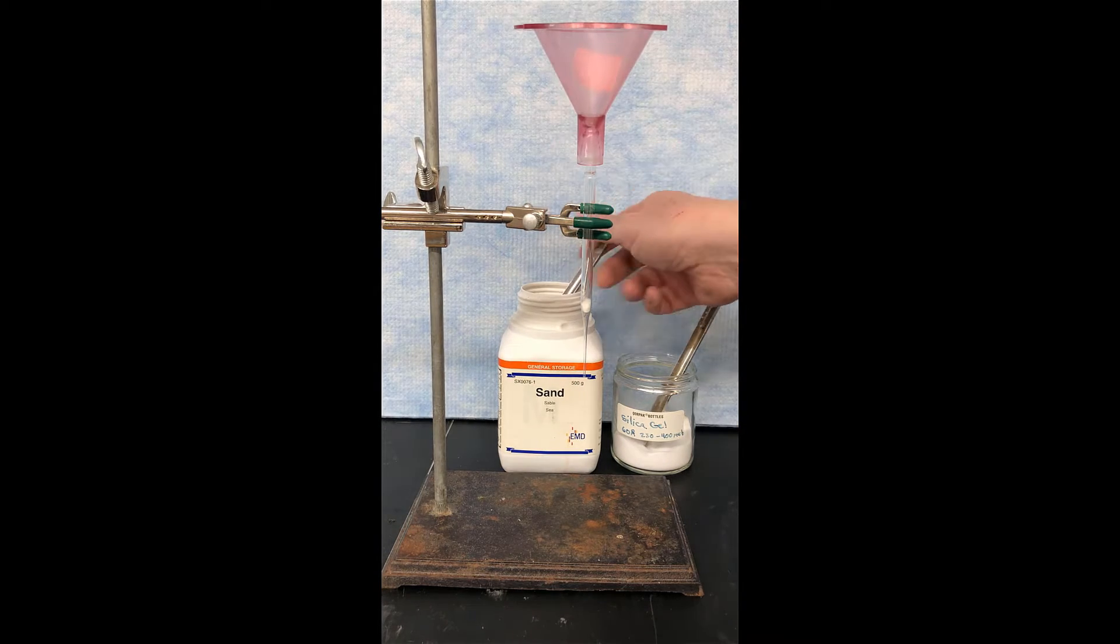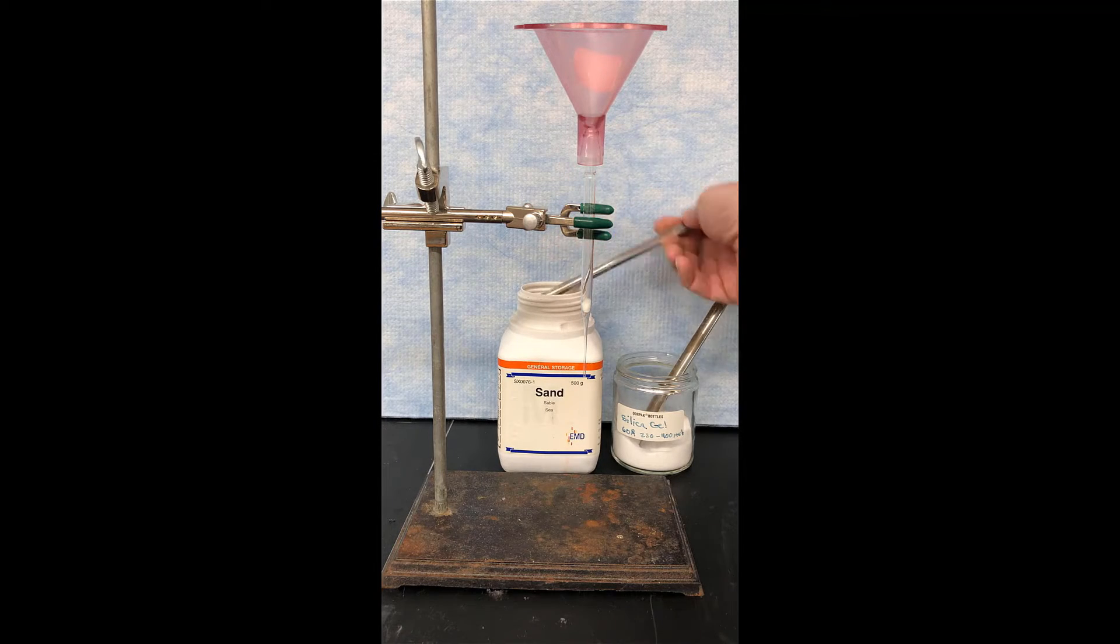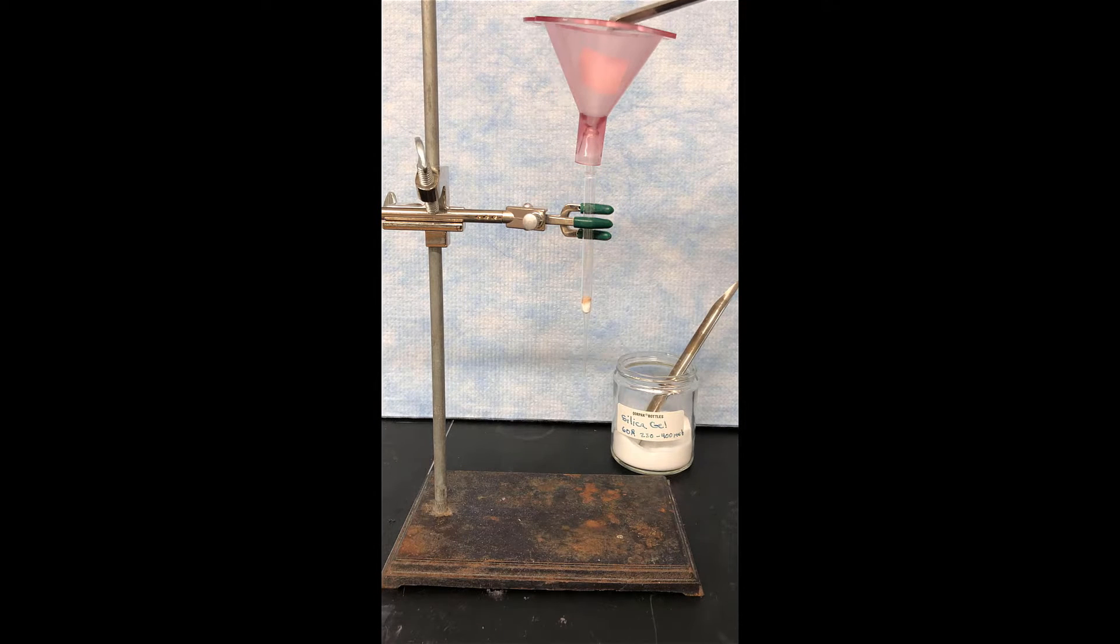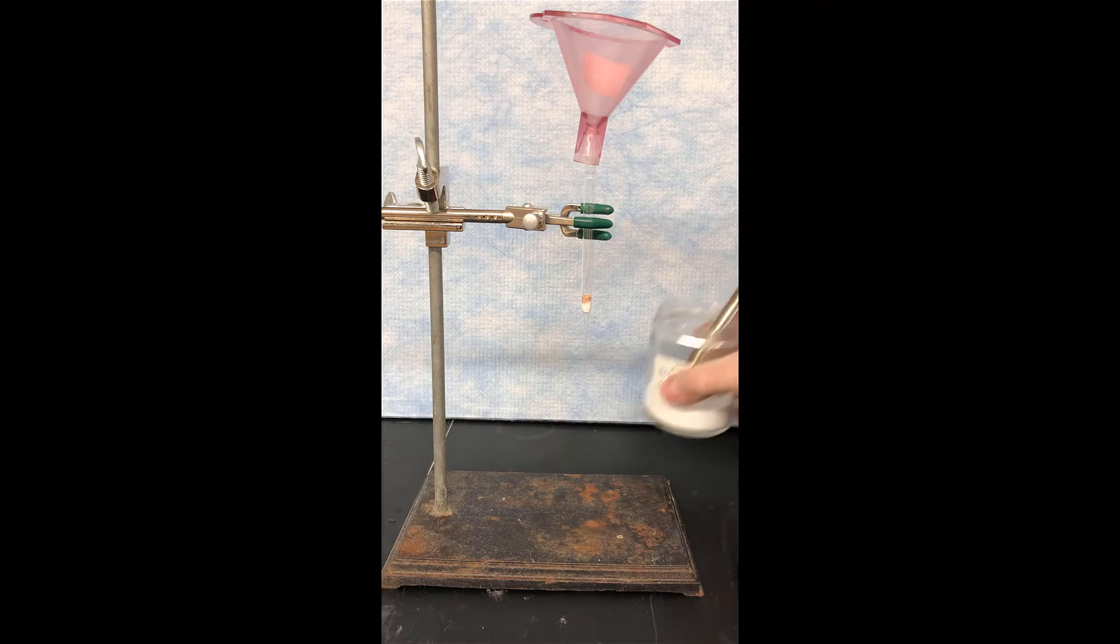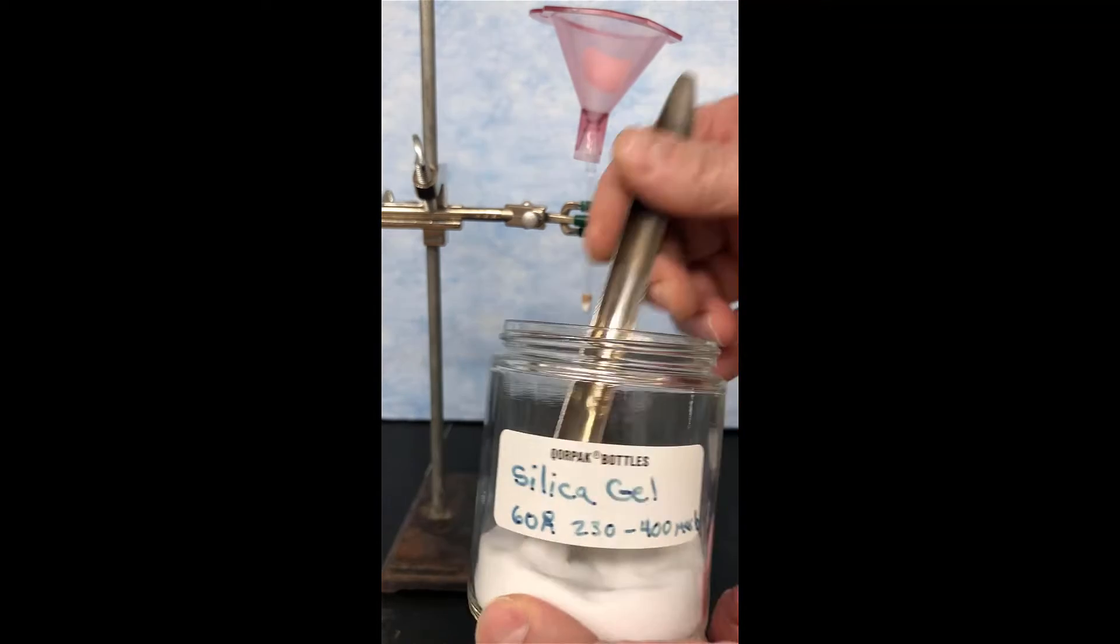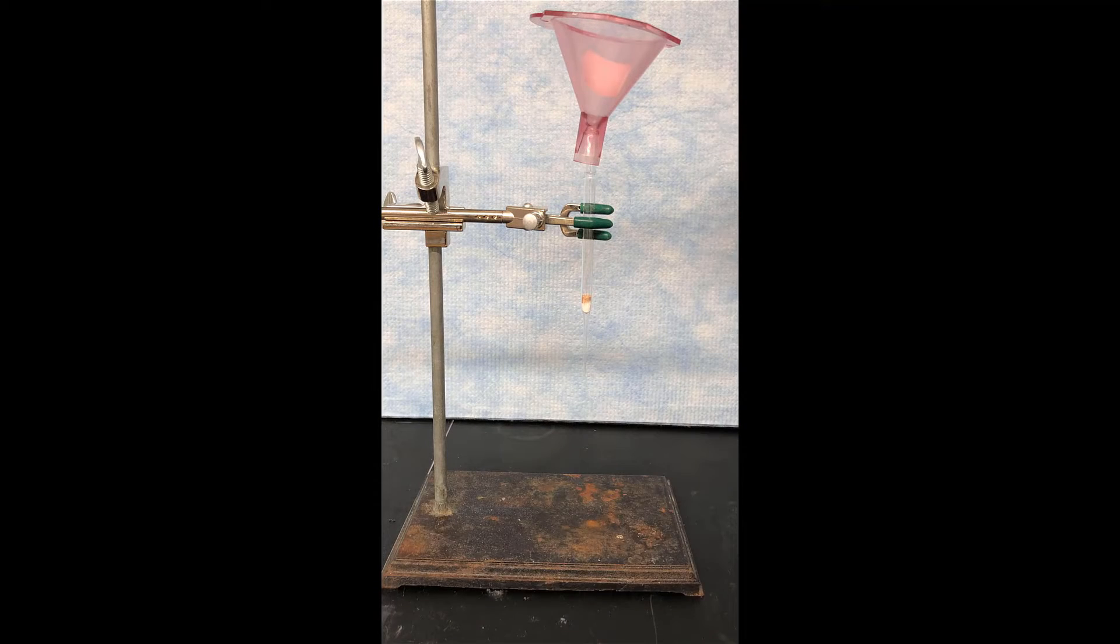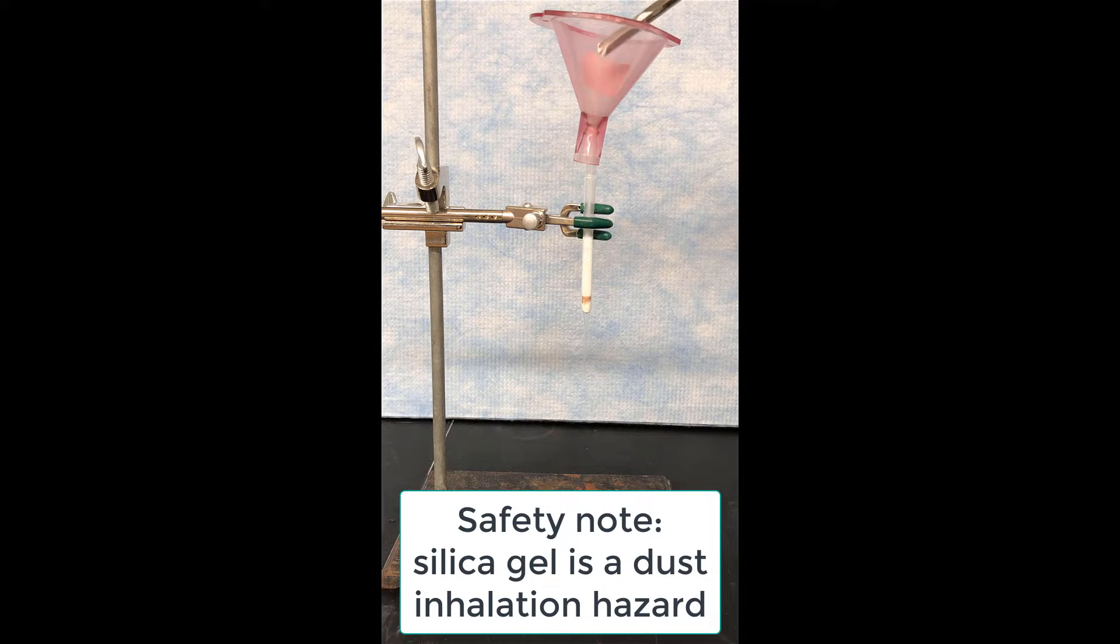We'll add some sand. The sand supports the stationary phase, which is coming next, so two to three millimeters of sand. Now we put in silica gel. That's the stationary phase. You've got to be a bit careful with this because it's dusty, so avoid breathing in dust from silica gel.